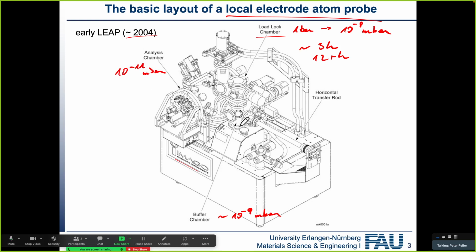And so we have different pumps. Here we've got turbo pumps, which you can see here. This is a turbo pump. Here you don't see it underneath. It's the same turbo pump. Oh no, sorry, it's not underneath. It's back here, the same turbo pump. And here we've got an ion getter pump. We'll also talk about that one.